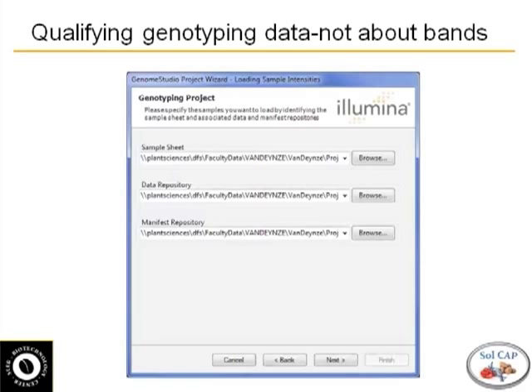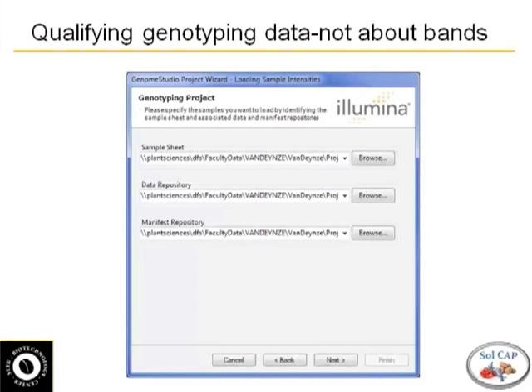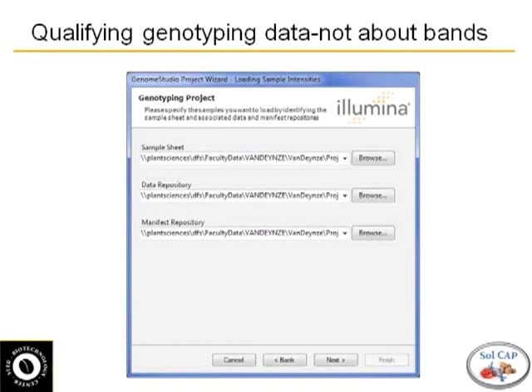So if you're using our Infinium chip, you're going to get data on 8784 SNP data points times the number of samples that you've submitted. Okay, so these are fairly large data sets. I'm not even sure if the new Excel Windows 7 or Windows 2007 can handle that, I'm not sure if the old 2003 can actually handle that volume of data with that many columns and rows.